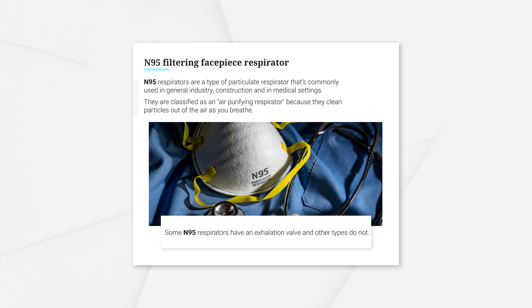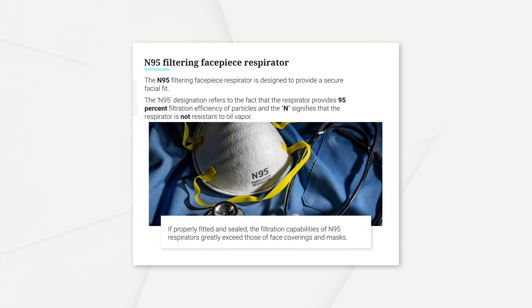Some N95 respirators have an exhalation valve, and other types do not. Non-valved N95 respirators should be used to protect the wearer and others from SARS-CoV-2. The N95 filtering facepiece respirator is designed to provide a secure facial fit.